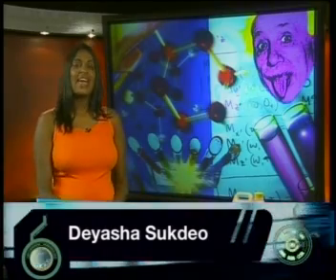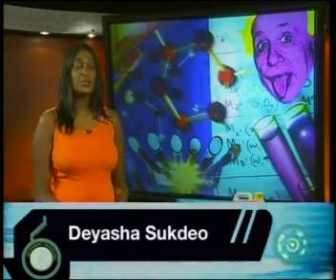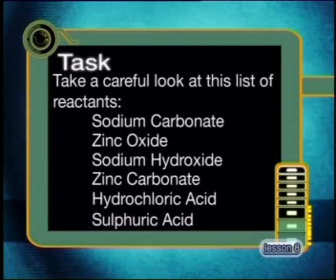Yasha. At the end of the previous lesson, your task was to prepare salts from the following reactants: sodium carbonate, zinc oxide, sodium hydroxide, zinc carbonate, hydrochloric acid, and sulfuric acid. Let's join John in the lab to see how some learners managed this task.